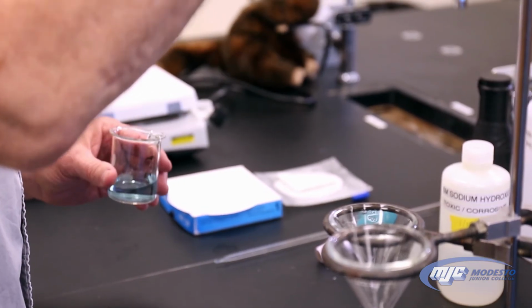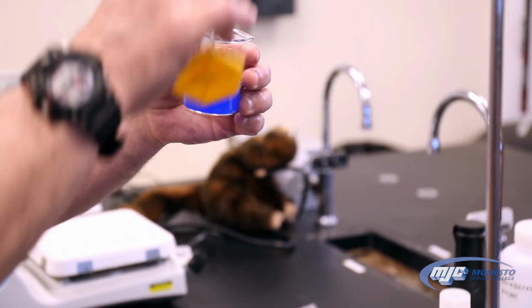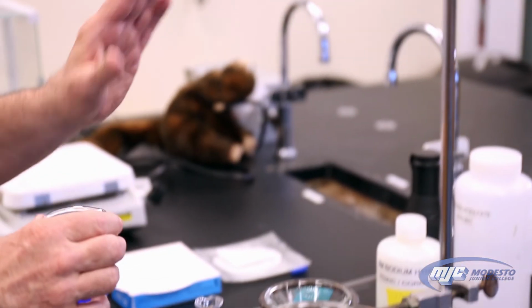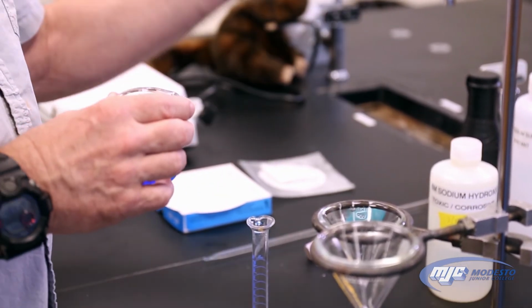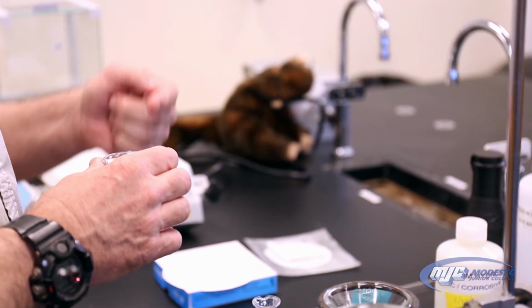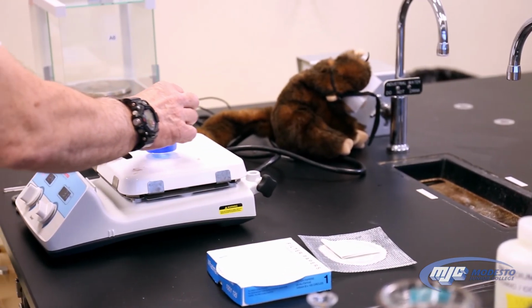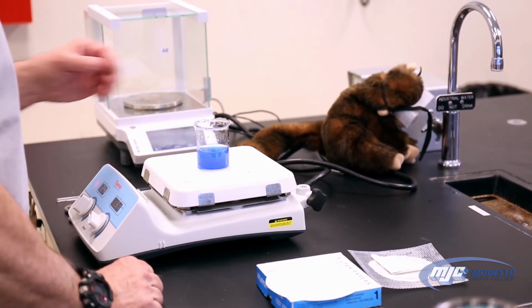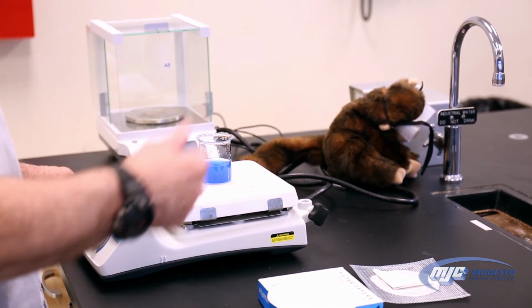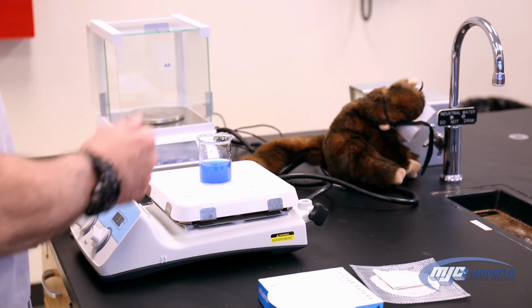So we're going to take about 10 milliliters of 6 molar sodium hydroxide, add it. See that blue color? That's our copper 2 hydroxide. We're going to do the same exact thing that we did in part A. We're going to heat this up, decompose the copper 2 hydroxide into copper 2 oxide and water, stirring it to make sure that it doesn't bump. So just like the first part, it's exactly the same reaction, guys. We'll know it's done when it all turns brown.